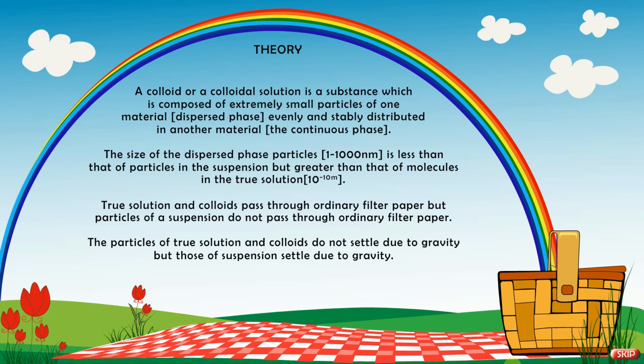This experiment is based on the theory that a colloid or a colloidal solution is a substance which is composed of extremely small particles of one material, that is dispersed phase.